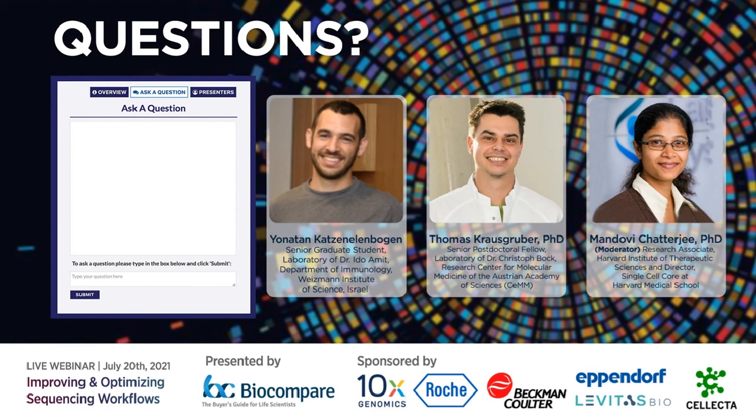So it depends. We recently purchased a new FACS machine that we can incorporate many fluorophores into, but whoever works with fluorophores knows that you have a compensation problem. It's quite limiting in that sense. You cannot integrate many markers, not dozens. We use like 10, maybe 12 markers at a time. And when we want to hunt down some specific cells, it might be quite tricky, especially when we're dealing with clinical samples.